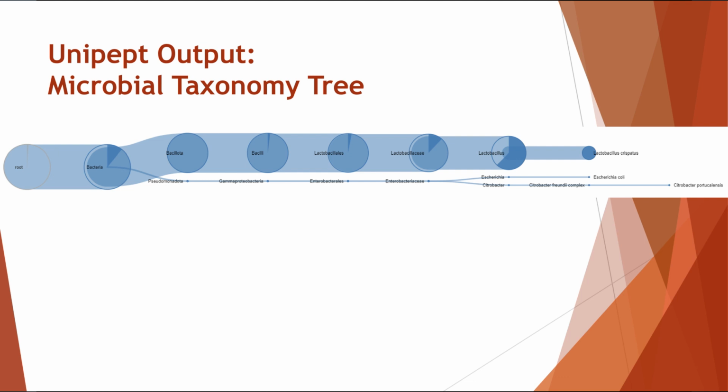The Unipept tool takes tryptic peptides as inputs, and for each given peptide, Unipept retrieves UniProt entries. These entries include accession numbers, as well as a complete set of organisms in which the peptide occurs. The set of organisms for each peptide is processed using the Unipept LCA algorithm to obtain the most specific taxonomic rank that the organisms share.